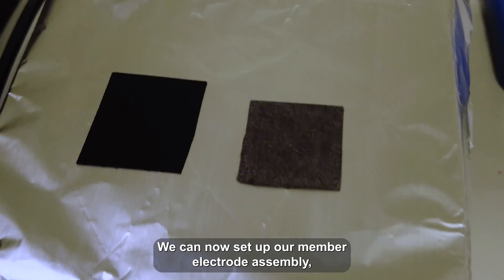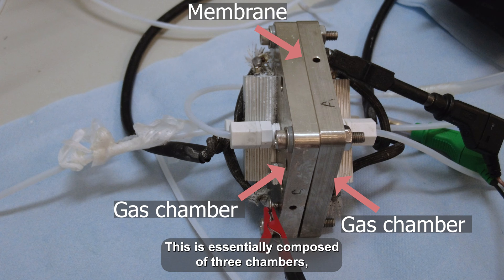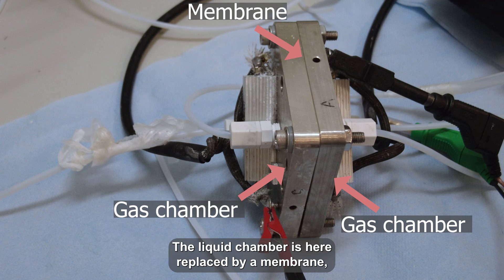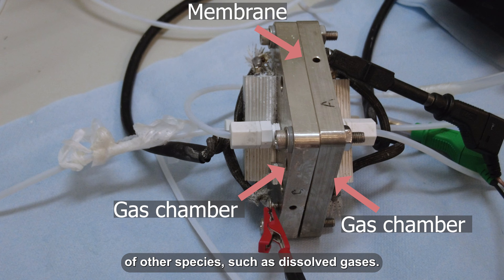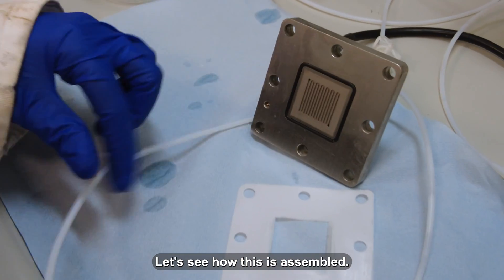We can now set up our membrane electrode assembly. This is essentially composed of three chambers: a gaseous chamber, a liquid chamber, and another gaseous chamber. The liquid chamber is here replaced by a membrane, which has the role of conducting ions and stopping the transport of other species, such as dissolved gases. The chambers are again separated by a catalyst-coated carbon paper.